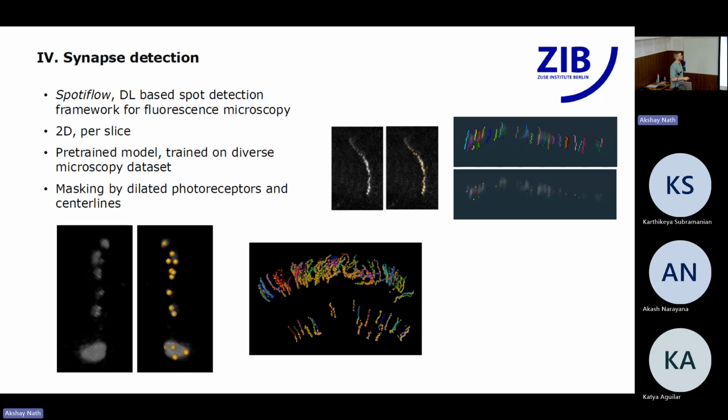I didn't follow that. The lower right image, you said there was only a single point representing what? So we want each synapse represented with a single voxel.